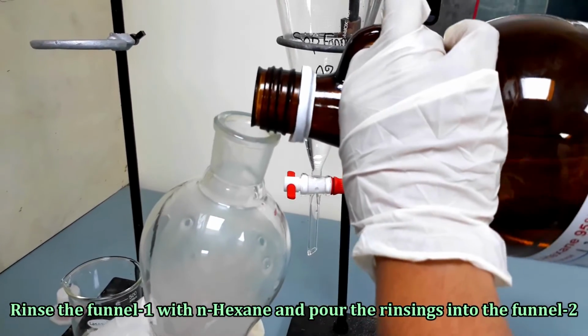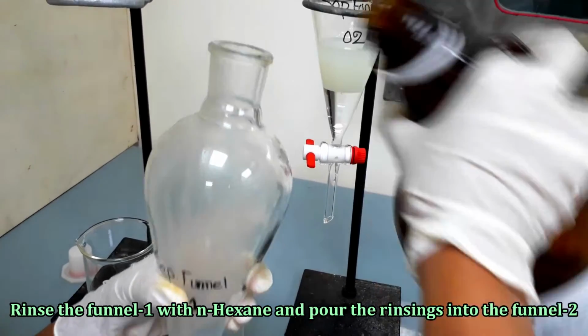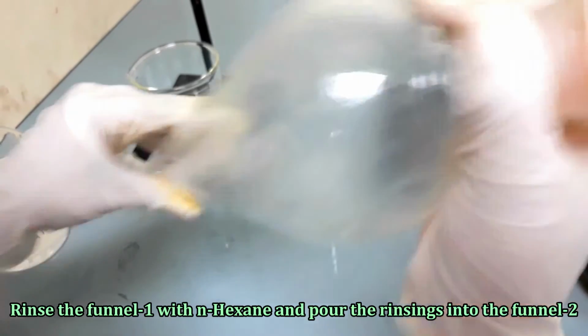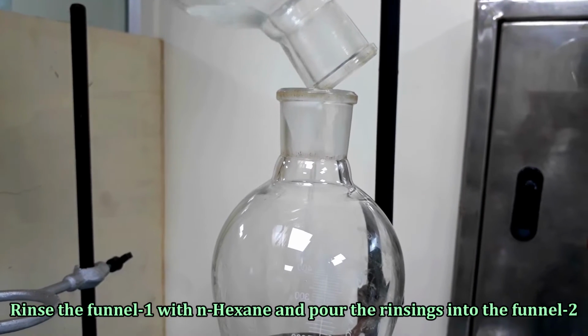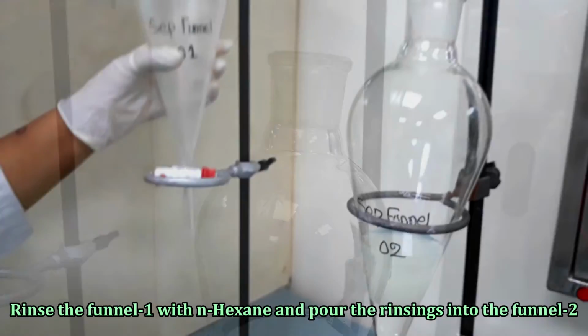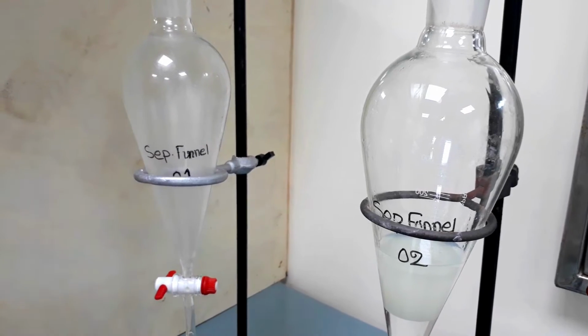Rinse the funnel 1 with n-hexane and pour the rinsings into the funnel 2. First extraction is completed.